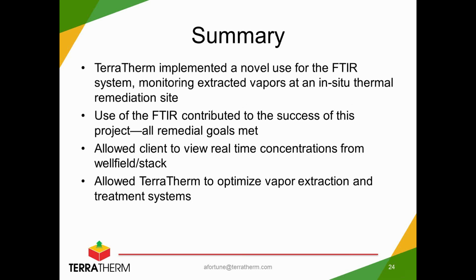So we implemented this novel use of the FTIR system at our in-situ remediation site. It contributed to the overall success of the project, and we met all our remedial goals. Like I mentioned, it allowed the client to view the real-time concentrations from the stack, which was a specific desire for that particular site and that particular client. And it allowed us to optimize our extraction and treatment systems, like I just mentioned. For other sites, we'd be able to optimize shutting down various locations throughout the treatment system as they finished up as well.